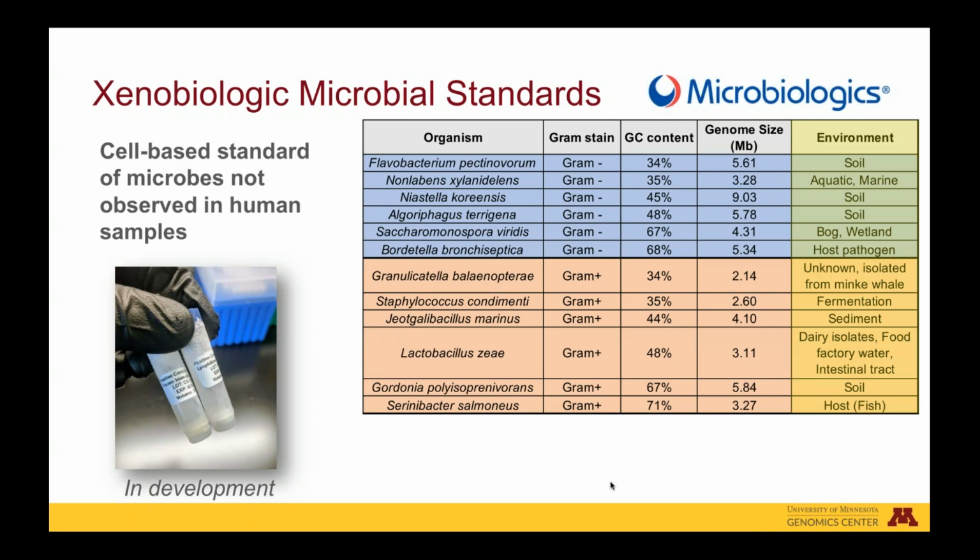And so what we hope is that we'll be able to use this tool to capture the diversity of microbial properties that might be present in a microbiome sample and track how those properties influence the resulting data. In addition, because we have enumerated cell counts on the members of this spike-in control, we expect it'll be possible to use this as a tool for calculating absolute microbial abundance.